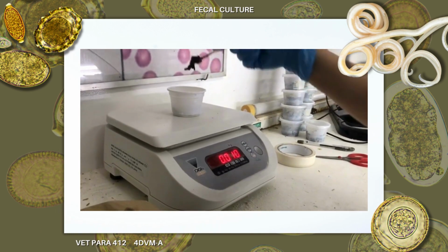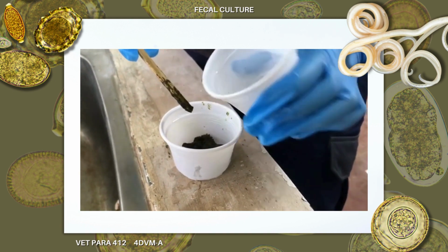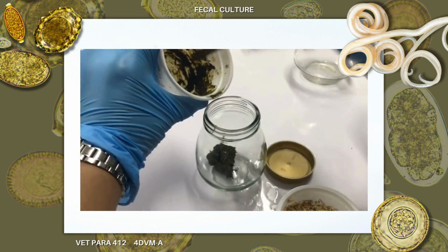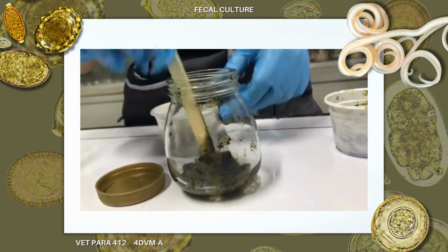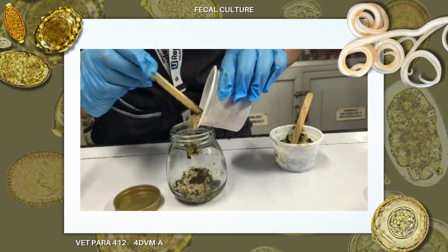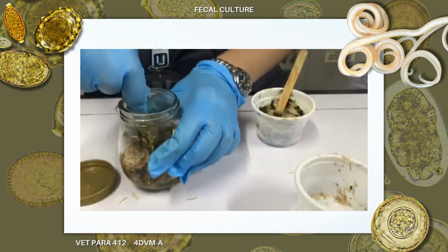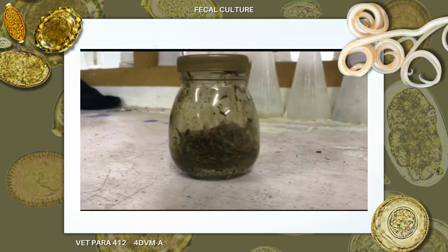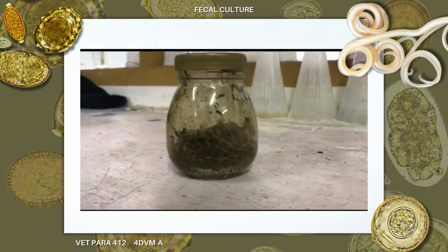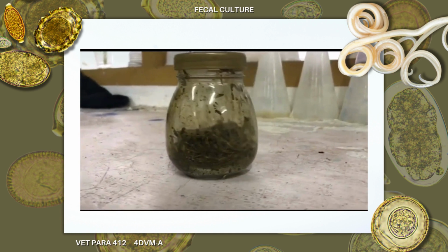Measure 10 grams of feces. Moisten the feces by putting a small amount of water and mix it thoroughly. After that, place the feces in the bottom of the glass jar provided. Then add sterile vermiculite or sterile rice hulls and mix to give approximately a 50-50 mixture. Close the lid of the jar and incubate at room temperature for a week. Larvae will migrate up to the side of the jar and may be seen as white mold-like material.